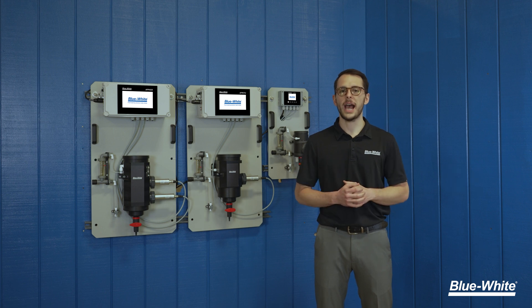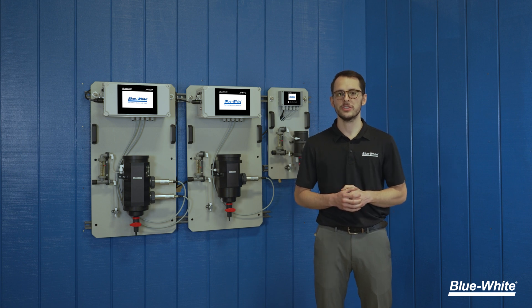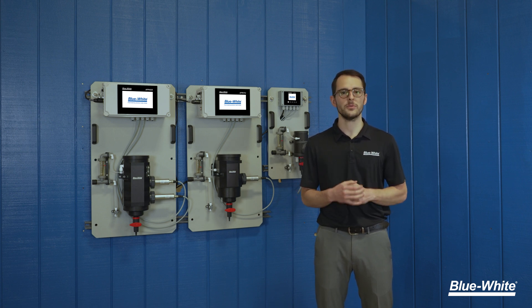We've designed our analyzers with the operator in mind. We offer three models to fit your application needs requiring little to no maintenance, saving you time and money. All analyzer panels are factory tested and ready to go right out of the box. And we back all of this with our 13-month warranty so you can have peace of mind with Blue-White's analyzer panels.